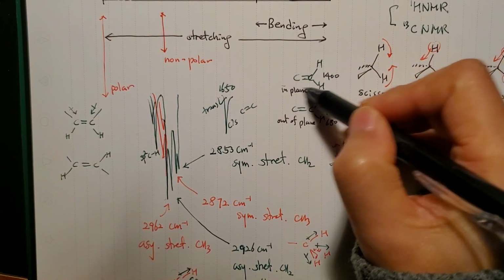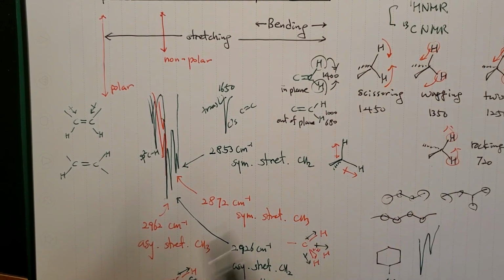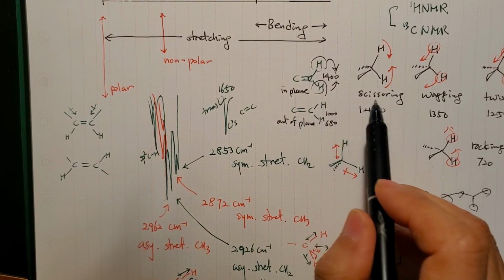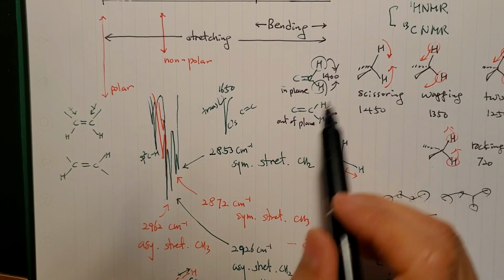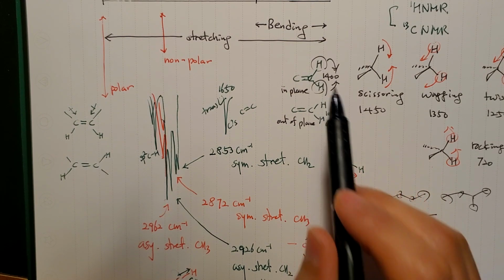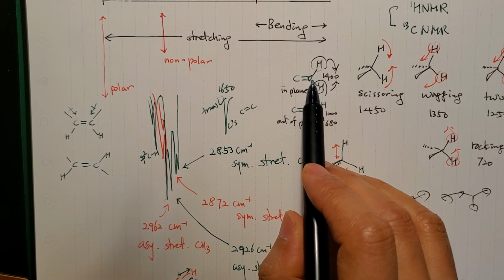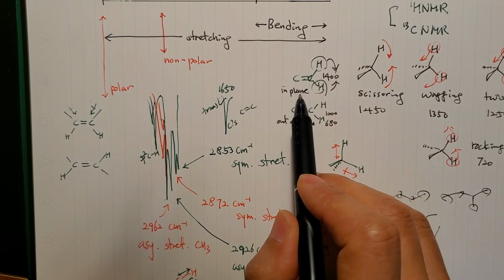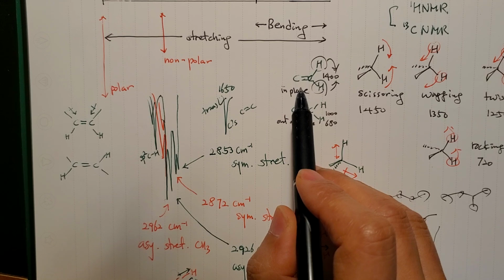So taking this example, when you have two hydrogens scissoring, like this case, in-plane vibration, the frequency can be similar to the scissoring here, about 1400, but the dipole moment is much greater than this case because the carbon here is more electronegative. So normally the intensity and the broadness is much greater with the double-bonded hydrogen.